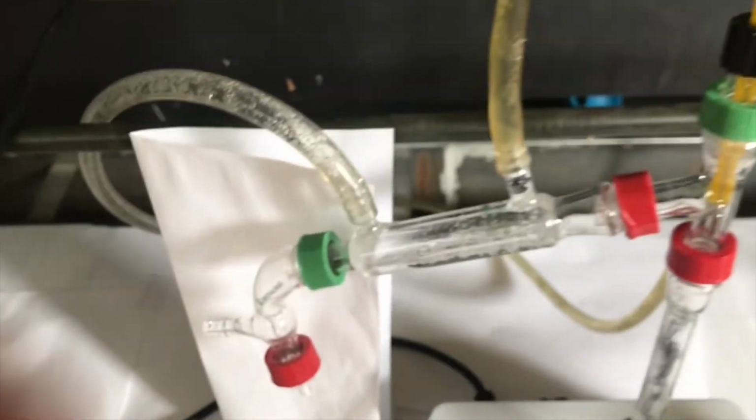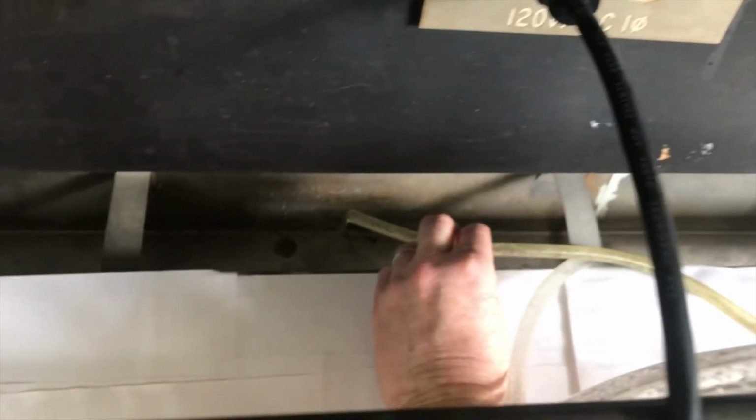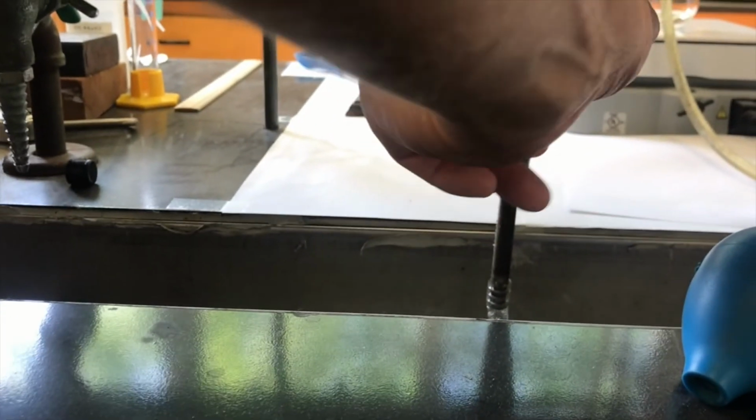And now I'll turn off the water. I still have the water going slowly, draining slowly. I want to turn that off, and when I turn it off, I have to be careful. This is when a lot of times students make mistakes. When they go to turn it off, they forget which way to turn the water to turn it off. So go slow at first, and I remember if I'm on this side, I turn it that way, okay, water's off. If I turn it the wrong way, I turn it higher, and then the hose can pop off and squirt water everywhere.